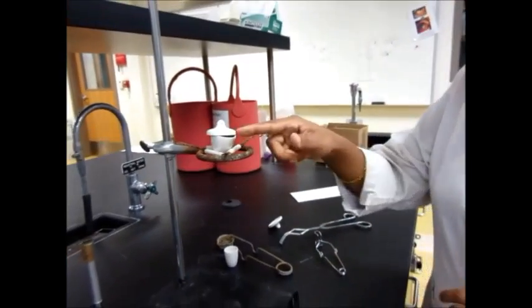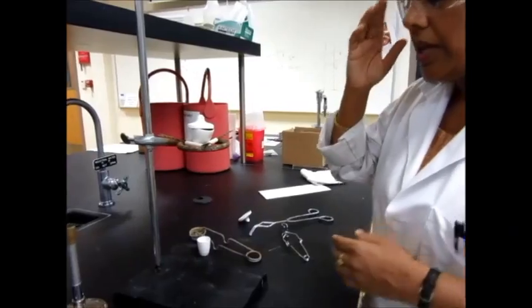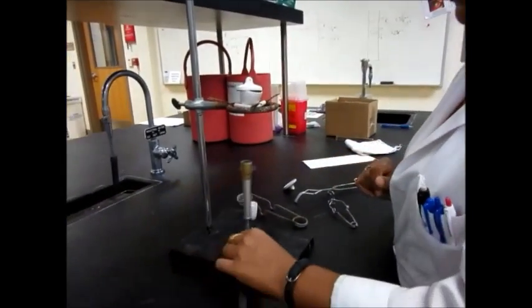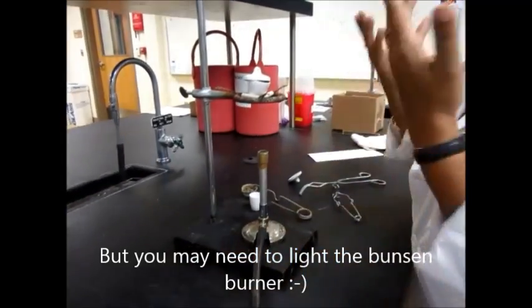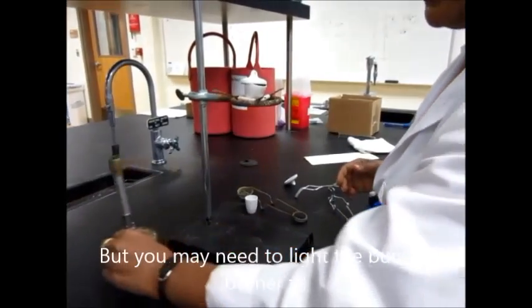And so here's the little open space for your crucible. And then again, I know the Bunsen burner is turned off, but then go ahead and place the Bunsen burner, do the rest of your experiment and you should be good to go.